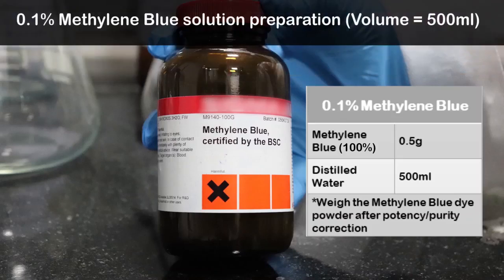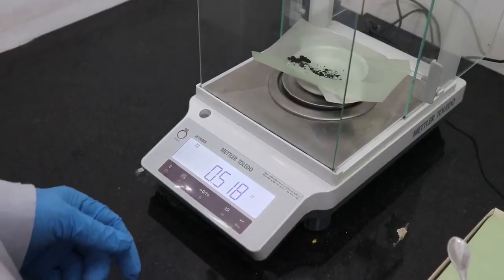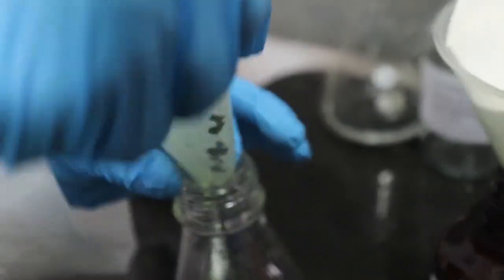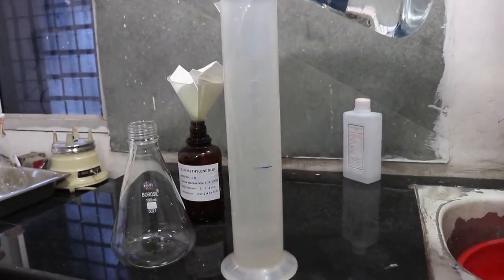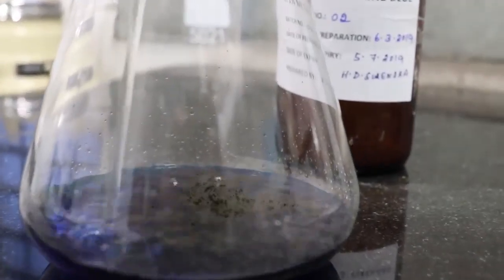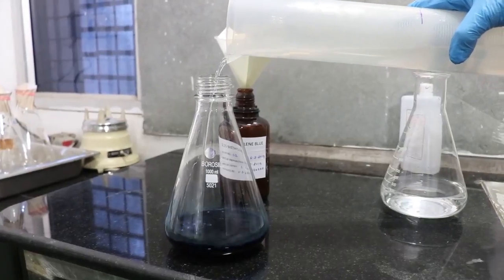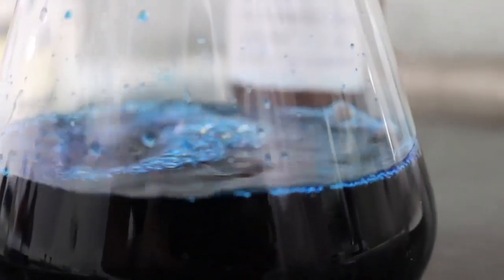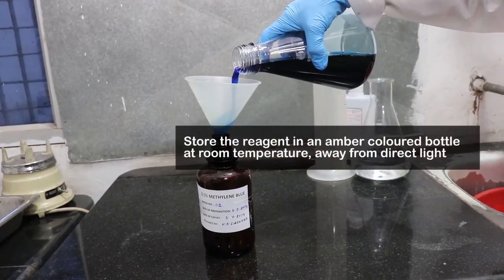Next, we will observe how to prepare methylene blue solution. Weigh 0.5 grams of methylene blue and dissolve in 500 ml of distilled water. Swirl to dissolve completely. Pour into a labelled bottle and store in a cool place away from direct light.